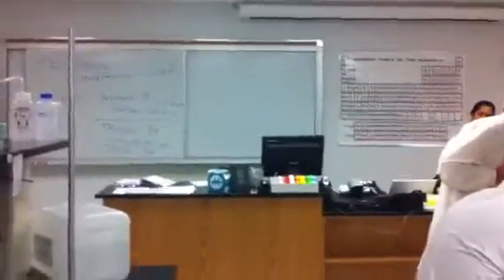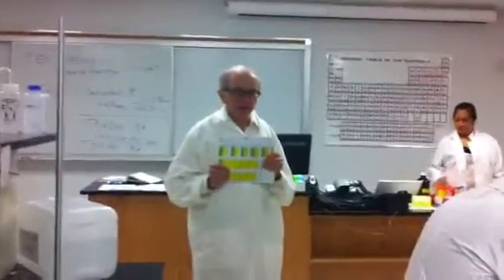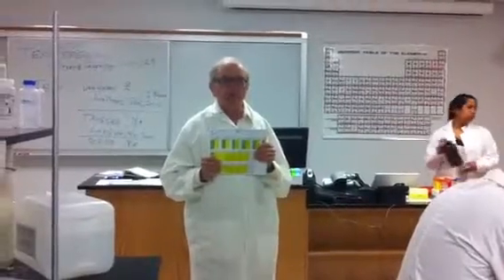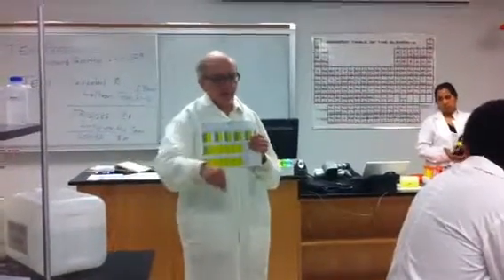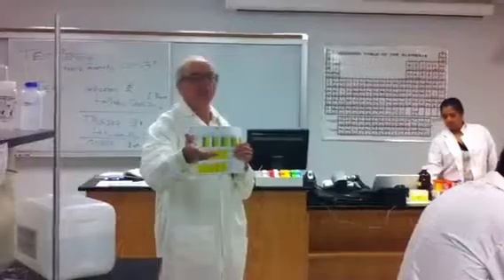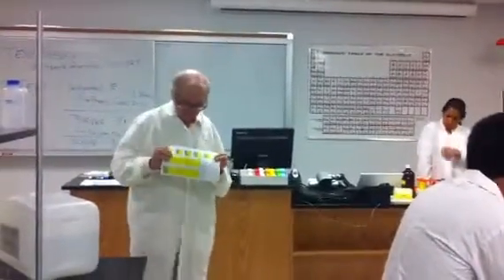Show that to me, and we'll just drop it. In other words, disqualify it. It was either a mix error, or a prep error, or someone got distracted and handed you tube 10 when they should have handed you tube 8, some weird thing like that. Or it could just be the temperature fluctuation in the room, which will give you a lot of error.